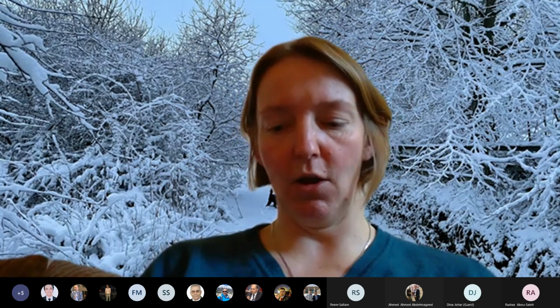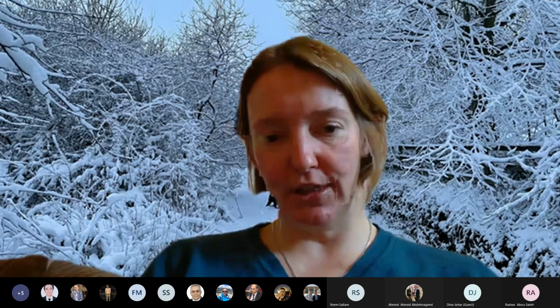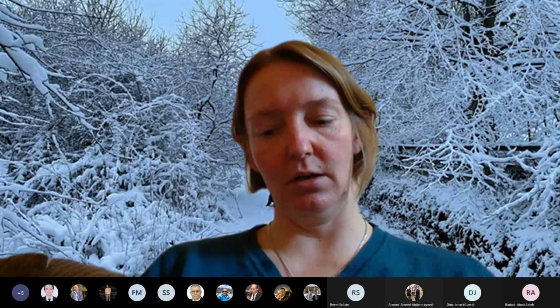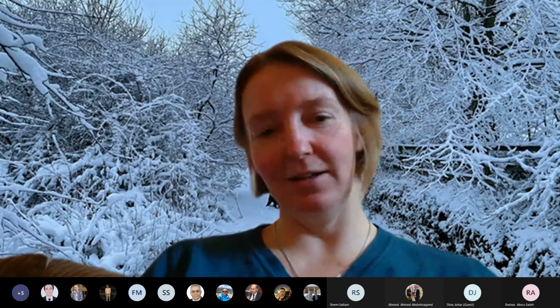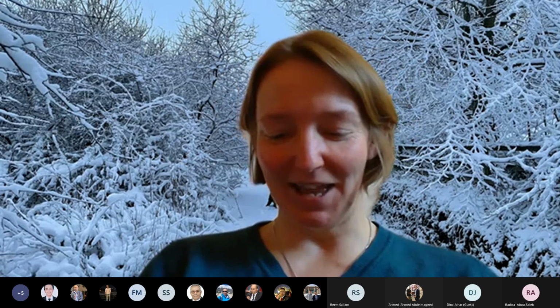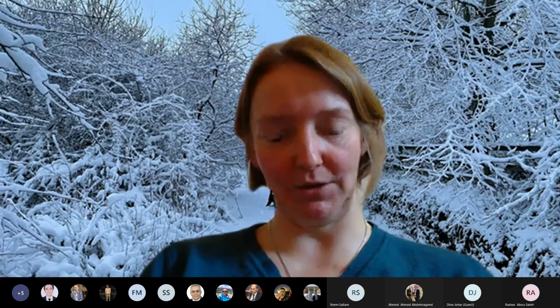And then the second question, which is a brilliant question, is yes, you can. I don't do it personally, but a lot of people do study the EMT, the transition, because they can change the environment and change the kind of cues that tell cells to behave in a certain way. And there's a lot of study on stem cells in particular in microfluidic devices, because you have such control over their environment that you can persuade them to go down one differentiation path compared to another. As I say, we don't do that personally, just because we're only really 3 years old in my group. But people do that, so it is possible in microfluidic devices.